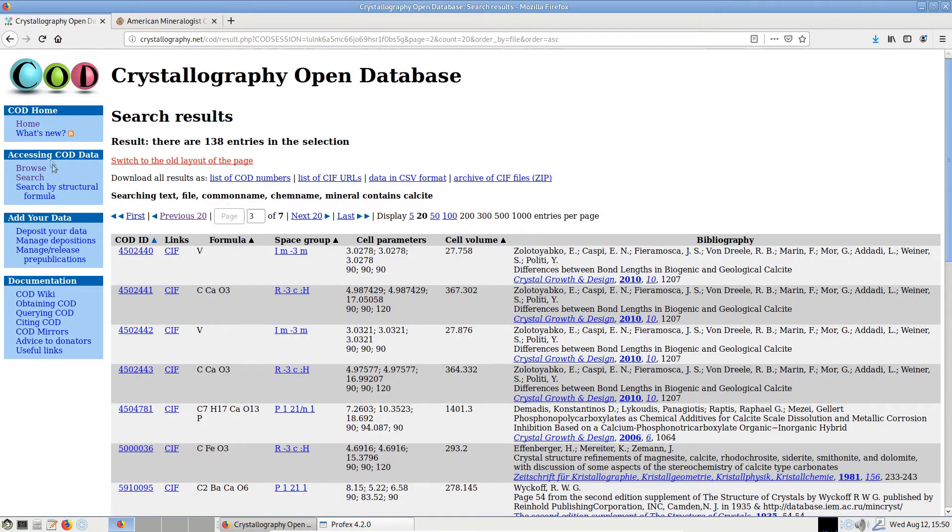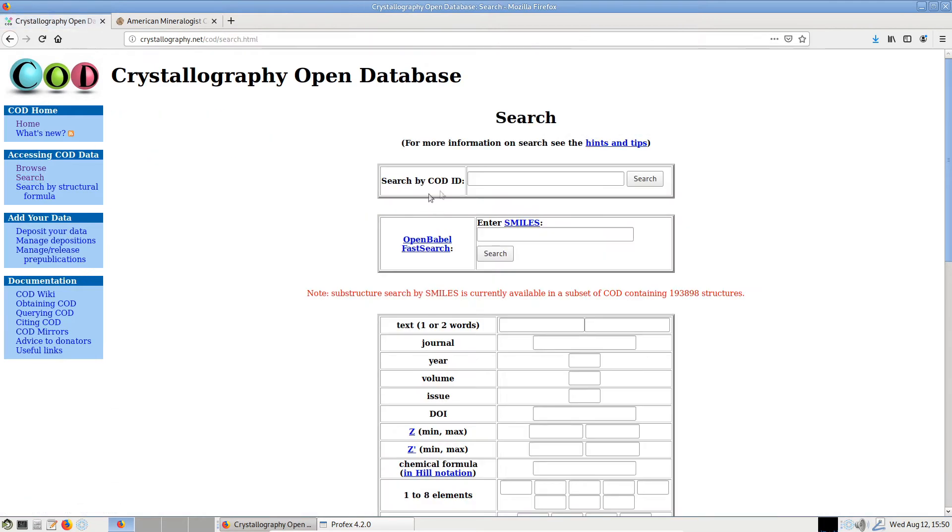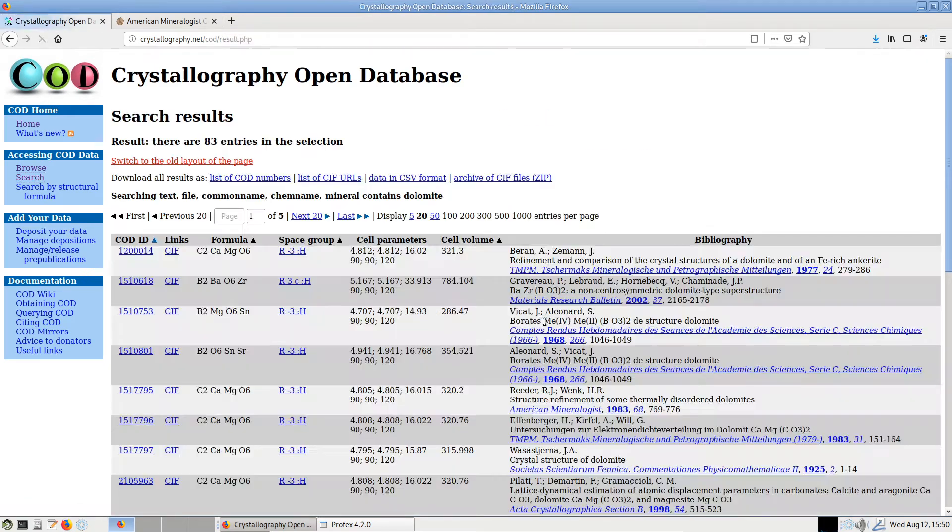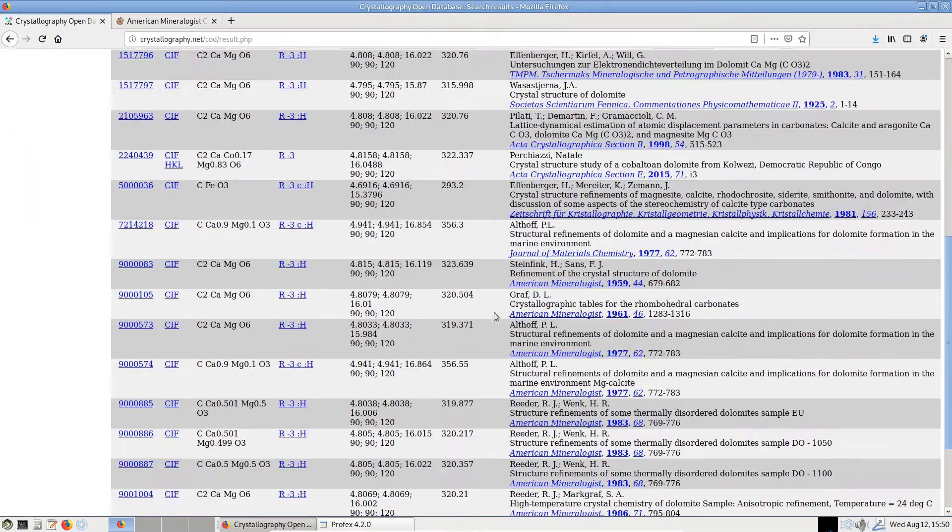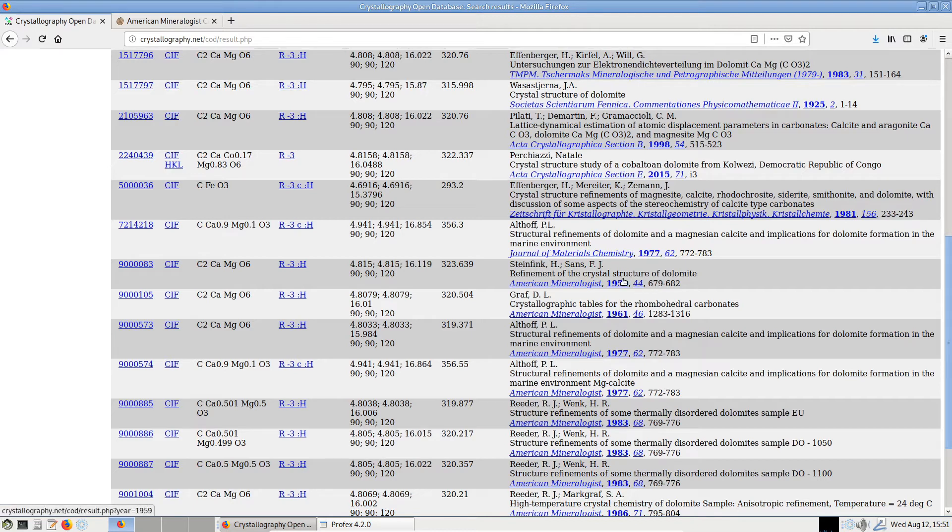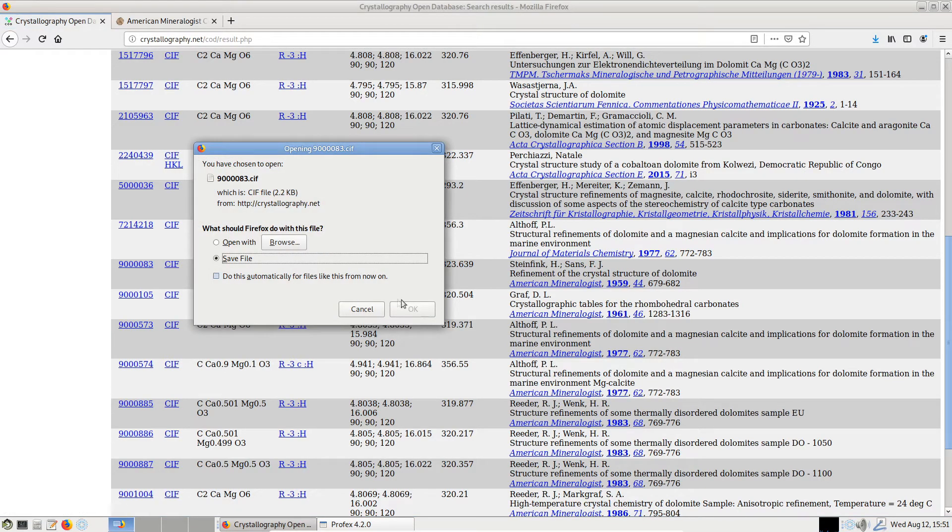Maybe let's search for dolomite. And maybe take this file - it's very old, it's from 1959, but let's just take this one.